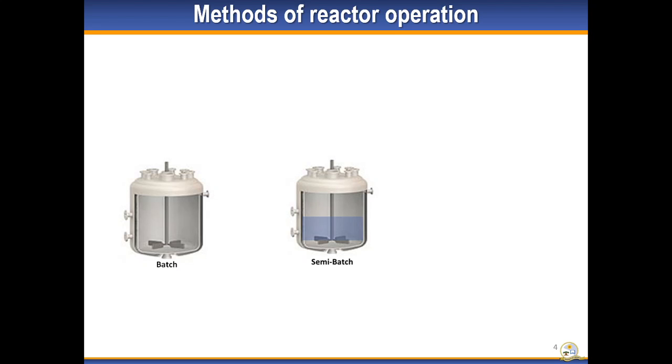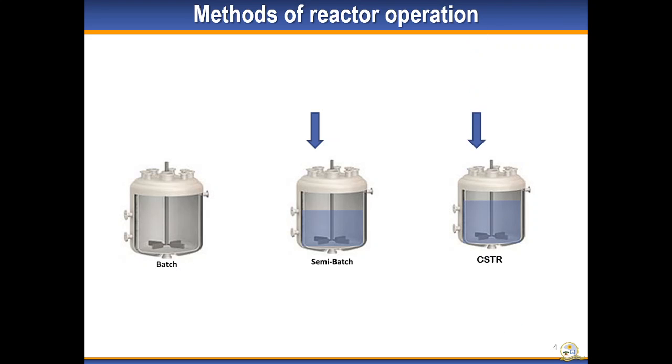Now, the reactor itself operates in two modes. Firstly, the semi-batch mode, and secondly, continuous mode. We do not operate the reactor in the batch mode for the sake of these experiments, however.